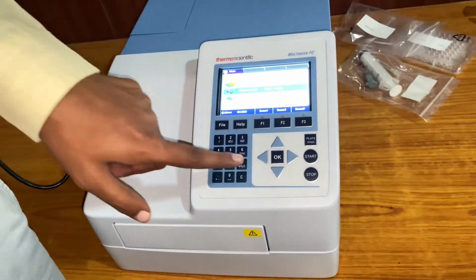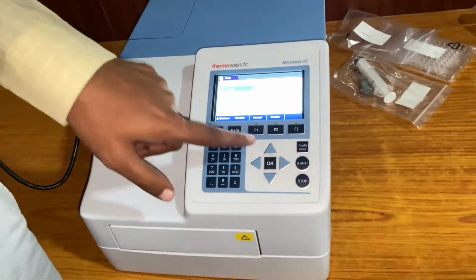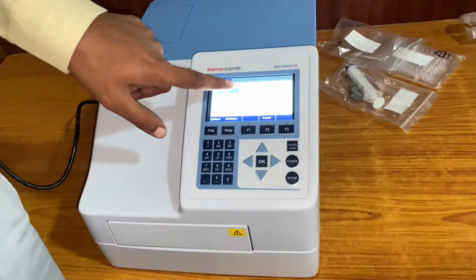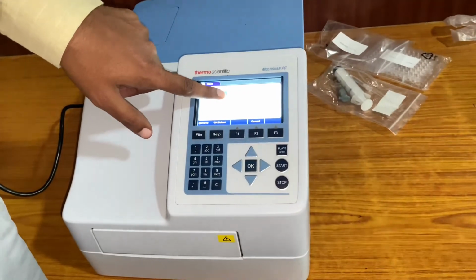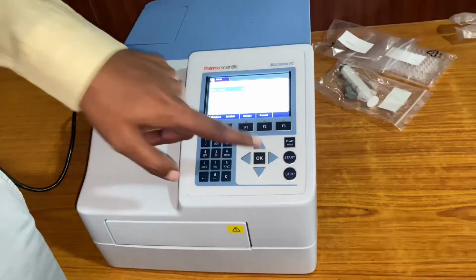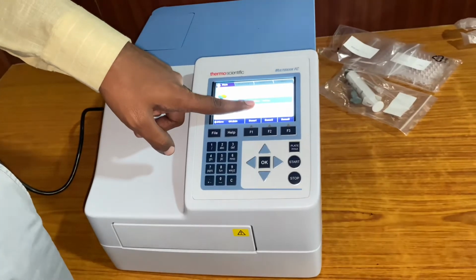In case of wavelength, if you want to edit, just press OK. In this, 405 is there. If you want to edit, just press OK. Here you see 3 filters, 405, 450, 620. Whichever reading you want, you have to choose. For example 450, I will just say OK. Then you say accept. Now you see it is 450.